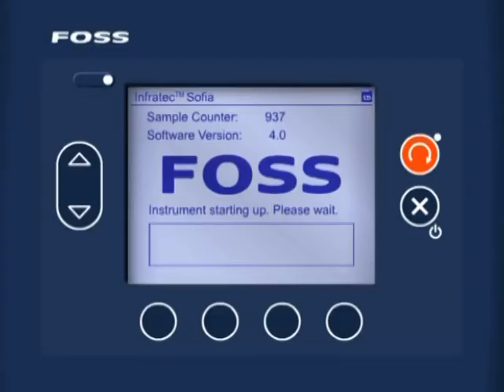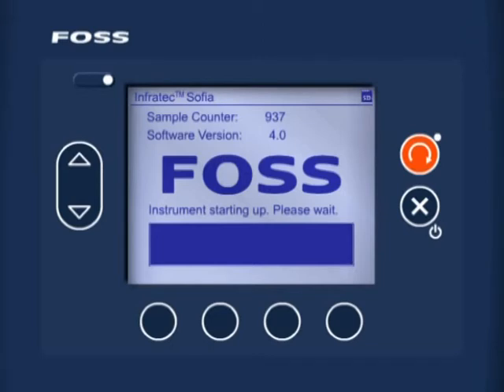On the instrument display, the start-up screen can be seen. The progress bar at the bottom of the screen progresses from left to right. The start-up procedure takes approximately seven to ten minutes, during which the unit performs self-checking and heats the lamp up to the working temperature.